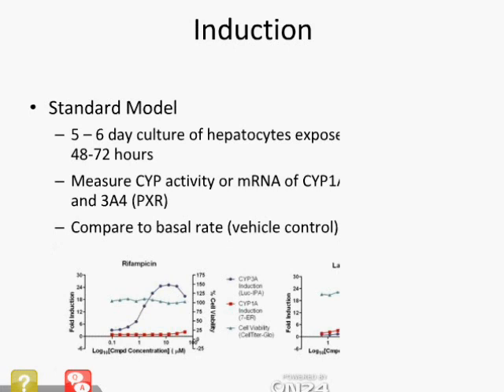In the right panel, lansoprazole was used as a positive control for CYP1A2 induction, another critical marker for drug-drug interactions, which is represented here by red squares. It too shows reduction of induction at higher concentrations, but with reduced viability as well. This may be interpreted to mean that the lower induction at higher concentration was due to cytotoxicity and not other mechanisms.